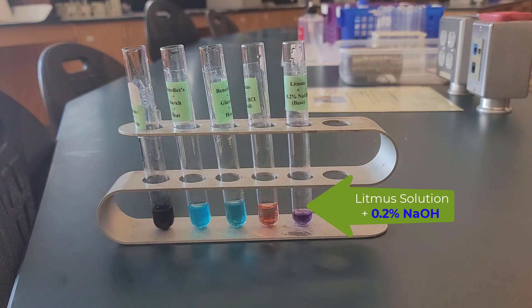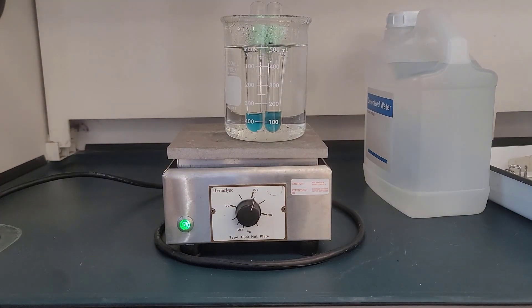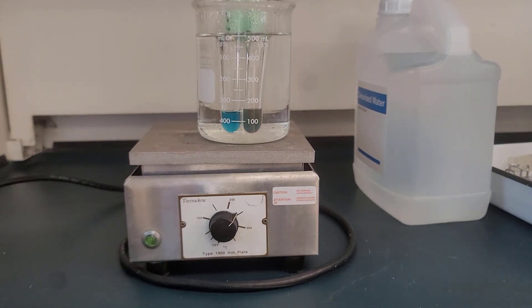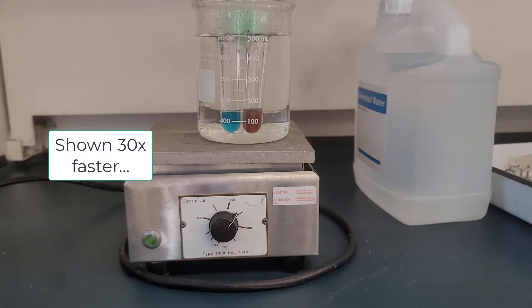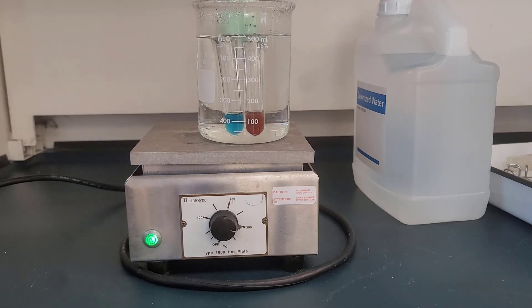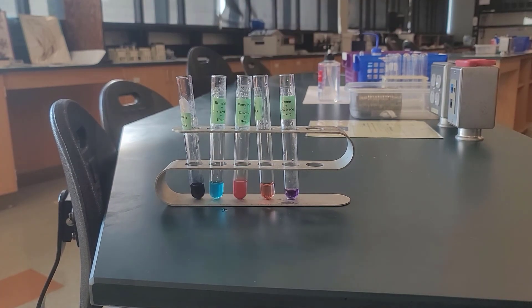Now we're going to go back to tube two and tube three. We're going to take our Benedict's and starch and our Benedict's and glucose, and put those in the hot water beakers that are underneath our hood. It takes a couple of minutes to heat them up, but this is what happens with the color change — that's what you want to note. Here are all of the tubes together, and these are the test results you'll need for the other parts of the lab.